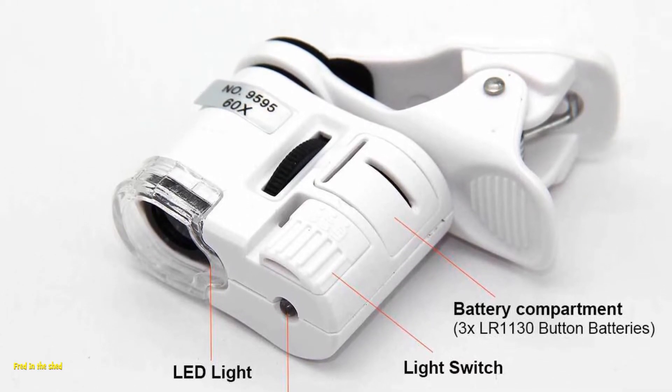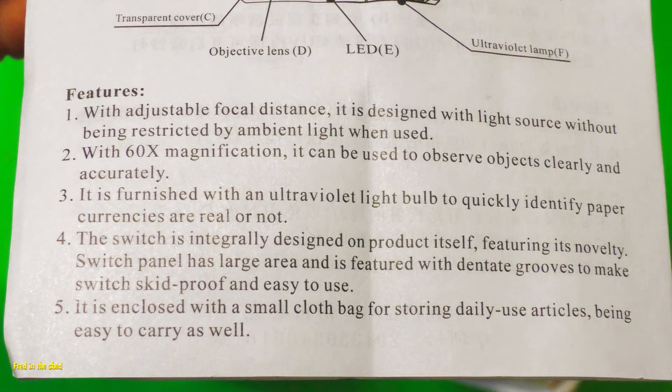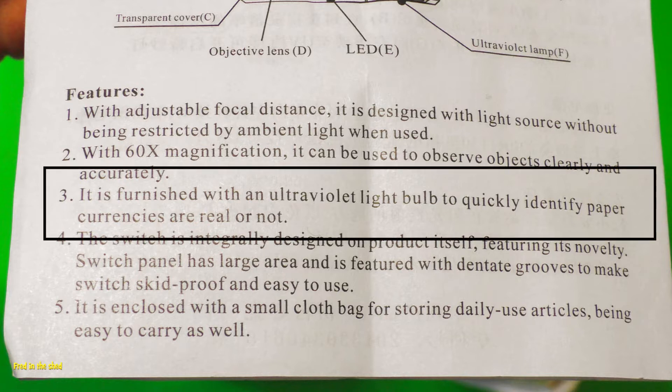I couldn't quite make out what that would be for, but once it arrived and I was able to read the instructions, it turns out it's for checking for counterfeit banknotes. I'm not really quite sure what that's doing on a microscope, but anyway, there you know.